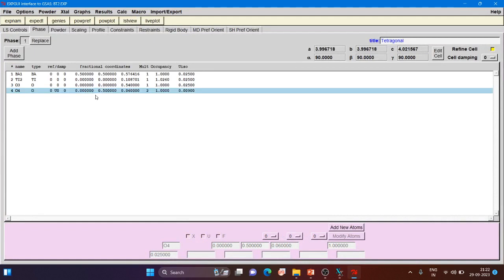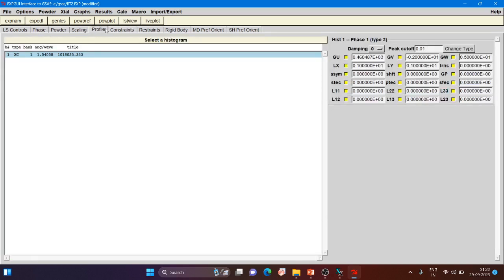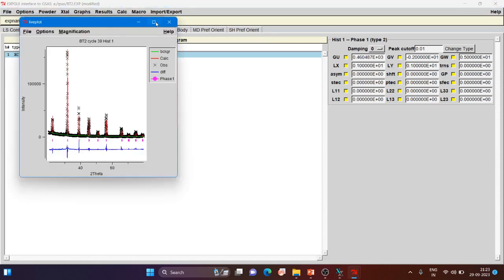Gradually it will reduce. It needs a lot of patience while performing this Rietveld refinement. It is not a very easy thing to refine and bring the chi-square to generally 1. Sometimes some students, while performing this Rietveld refinement, just click on all the functions. If you do such things, it is likely that your chi-square may increase up to 100 or sometimes 1000, or it will not reduce, rather it will increase, and the goodness of fit which you have achieved may be disturbed again.